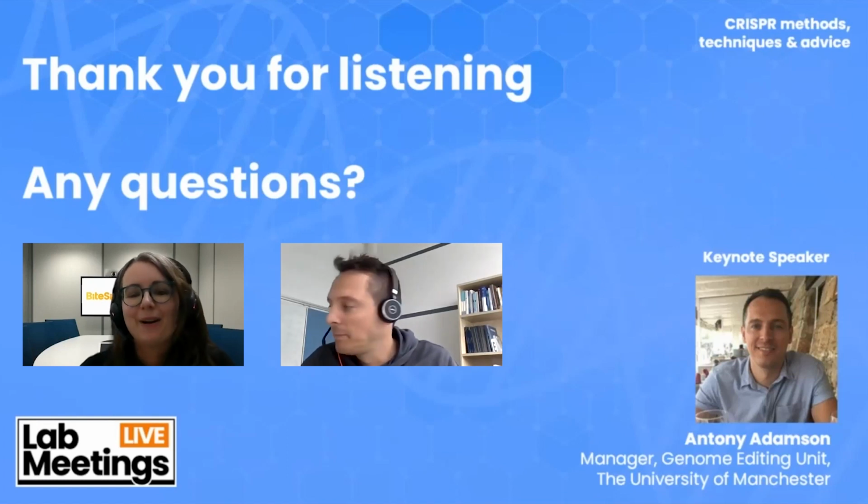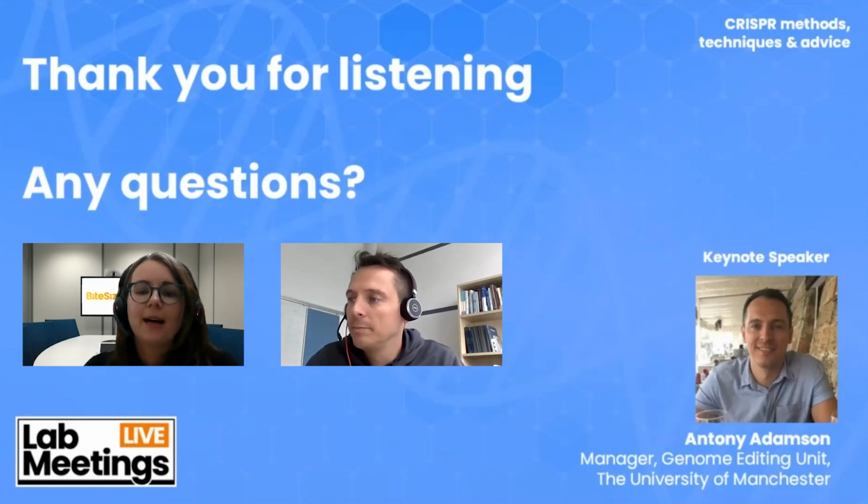Right, thanks for that, Anthony. Another question is from D. Do you use multiple sgRNA co-transfection approach for cell line knockout project?